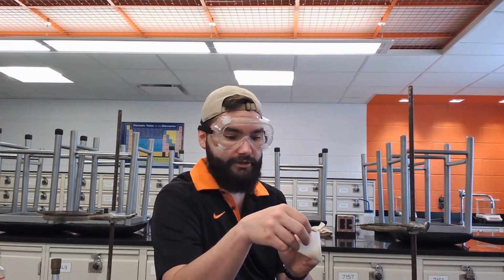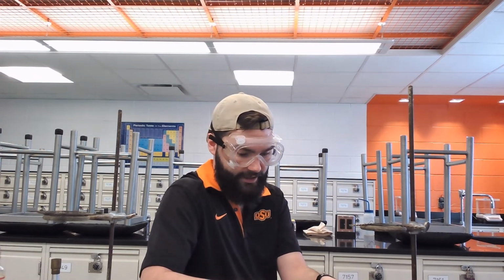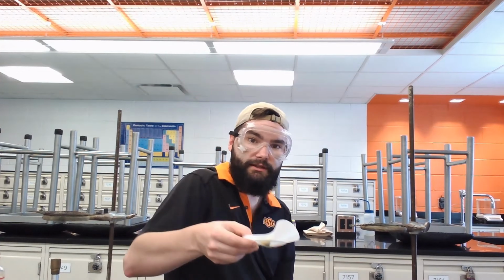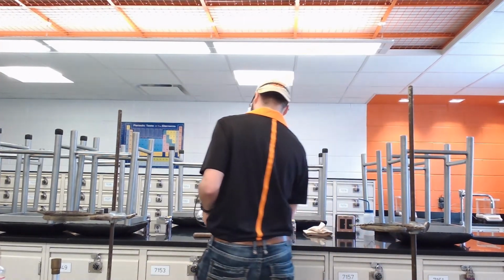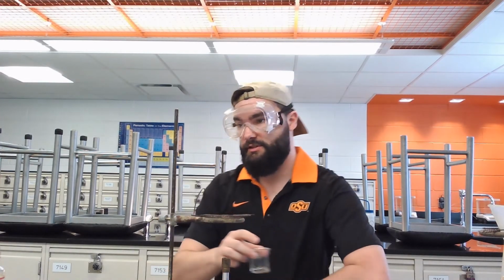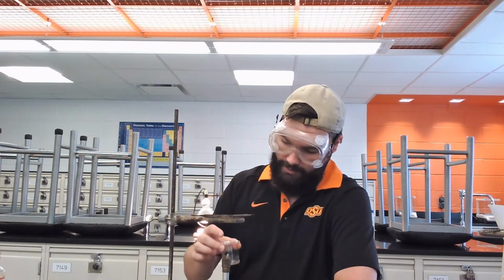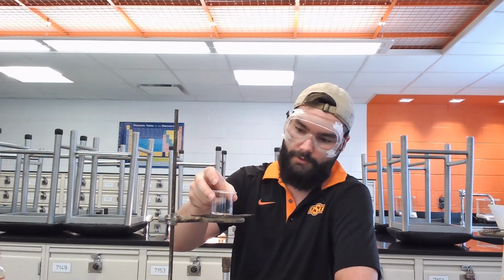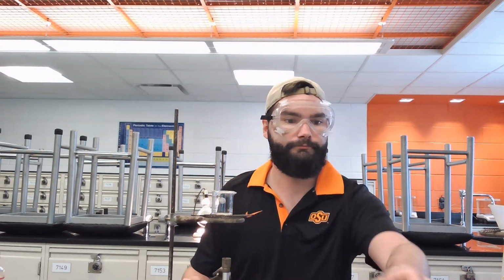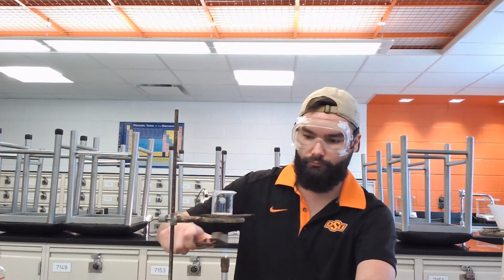So to dry this filter now, I'm going to carefully open it up, set it down on my watch glass, and set everything underneath the heat lamp to dry. So meanwhile, while the silt is drying behind me, I'm going to take my salt water and dry it out over the Bunsen burner.